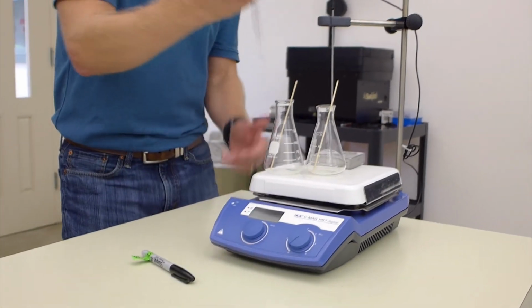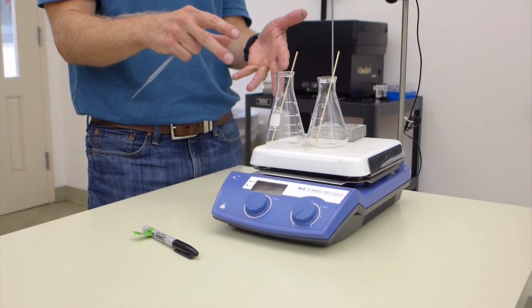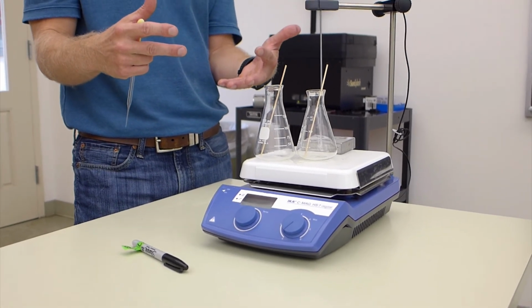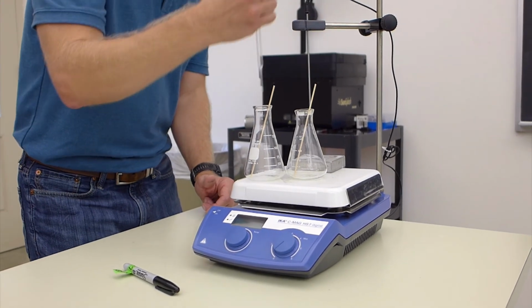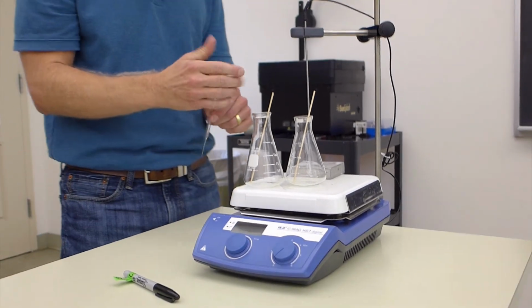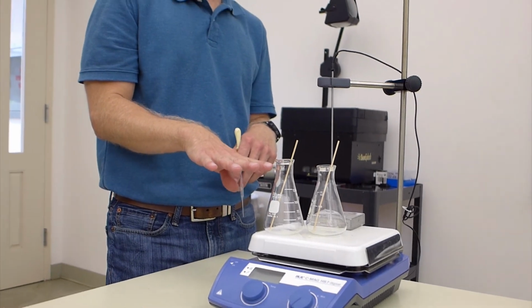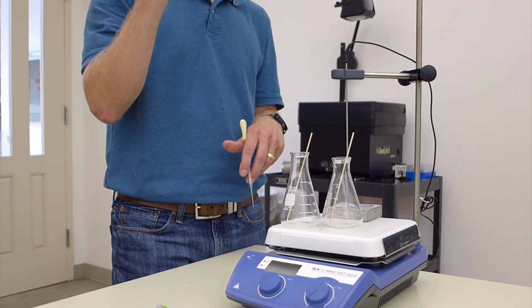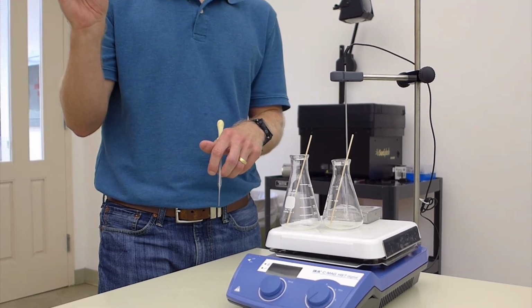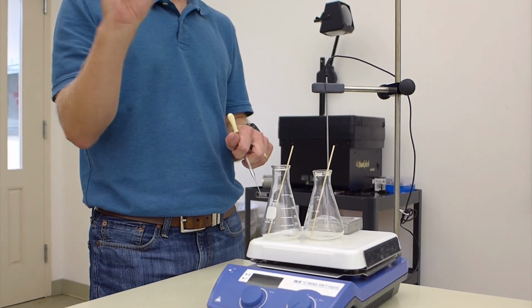You'll transfer solvent. Each time you transfer, swirl it around, wait till it boils again. Once it's boiling, if there's still solid, you haven't gotten there yet. Right? You're going to want to make sure that all the solid is gone. So you keep transferring, and there's usually a moment when the solvent in there goes from a really cloudy to a nice clear, it's sometimes colored, but it's clear solution. And it usually happens with just a couple of drips.